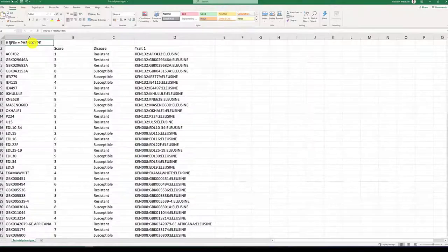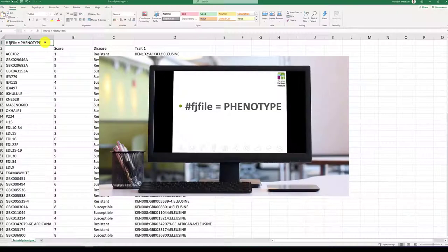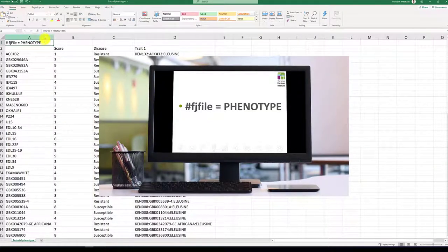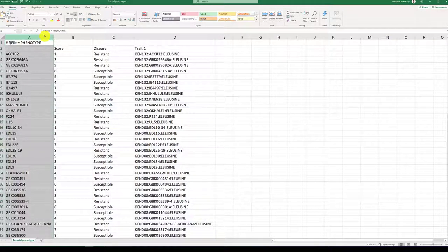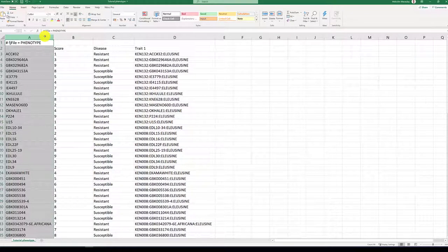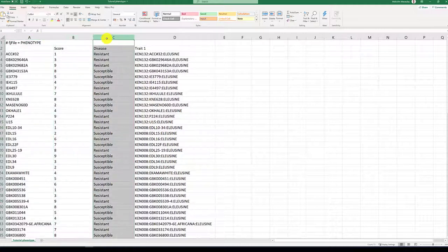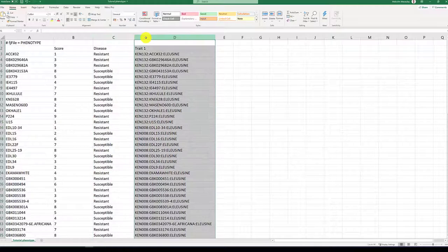A phenotype file should contain the header line, hashtag fjfile equals phenotype. It should contain a row of sample names which match your genotype file and columns which contain phenotype scores in either categories or numbers.